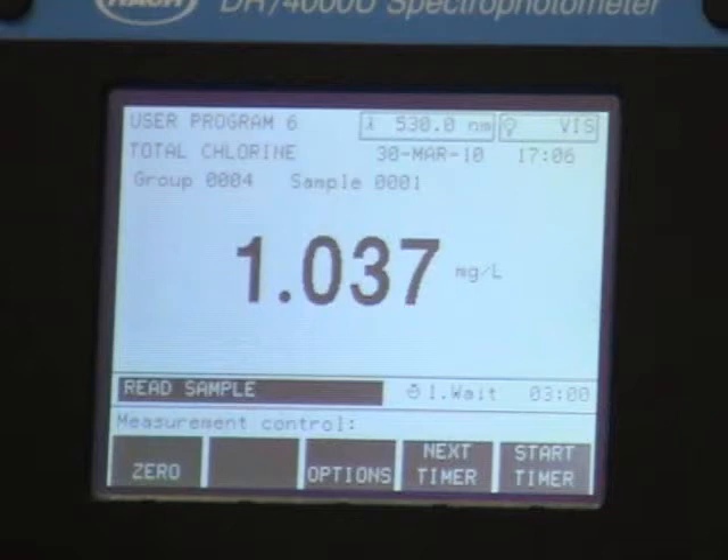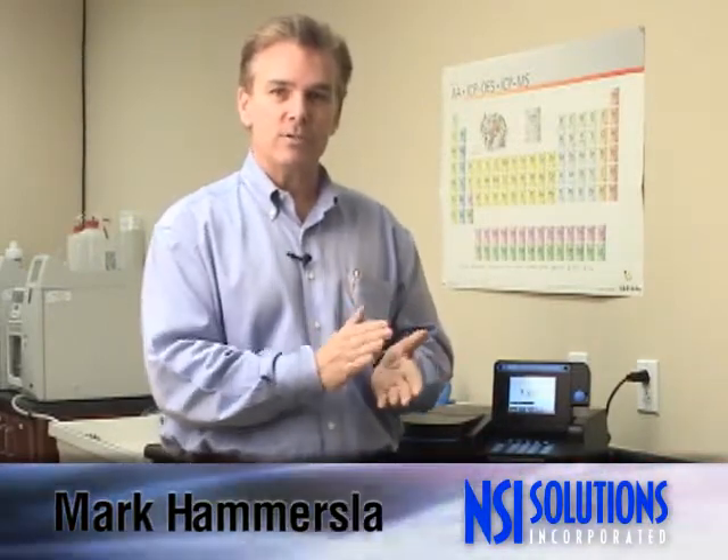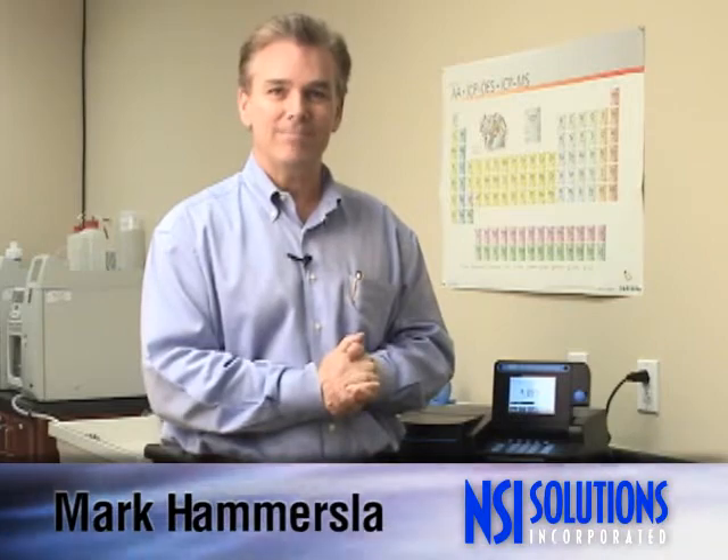I didn't quantitatively dilute this — you'll be more accurate if you use ASTM class A glassware. So here we have it: QC check standards, single-use Teflon tubes, very easy to use, stable, and accurate. Thank you.